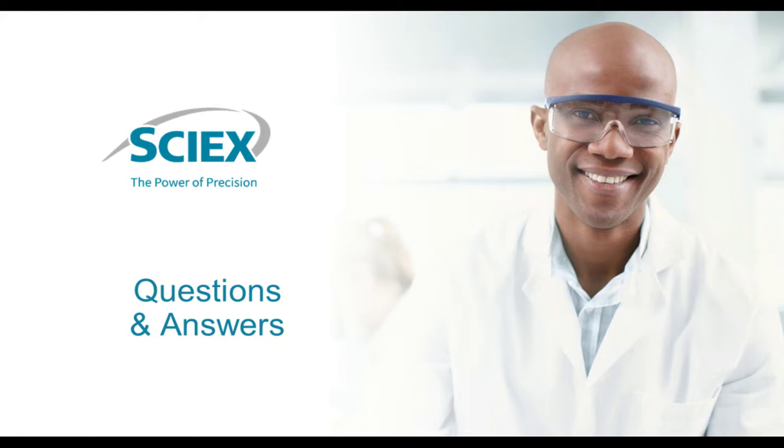Okay, thank you, Steve. Our next question is, what size RNA molecules have been analyzed by CE? Yeah, again, we've analyzed even the smaller RNA molecules, so 25, 30 mers can be analyzed. That's the smaller end, and then there are the bigger messenger RNA molecules. Of course, as I mentioned before, when the listener asked if you could analyze above 10 kilobases, you generally have to adjust your kit.